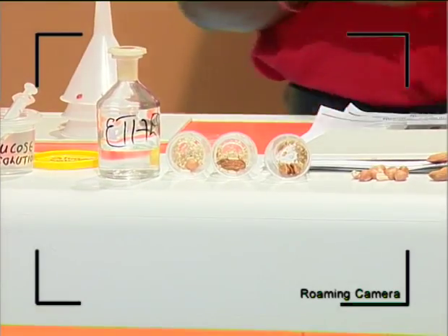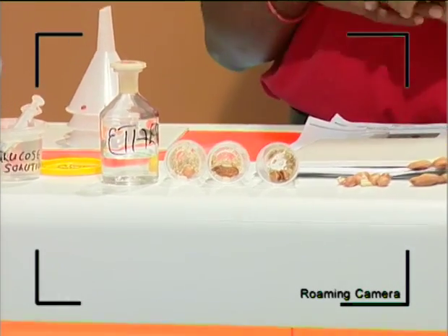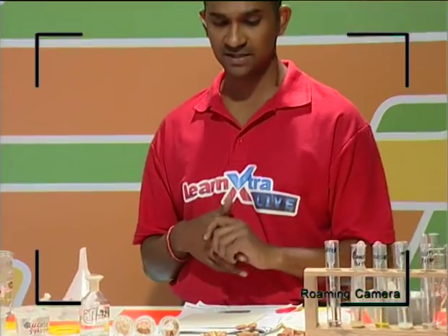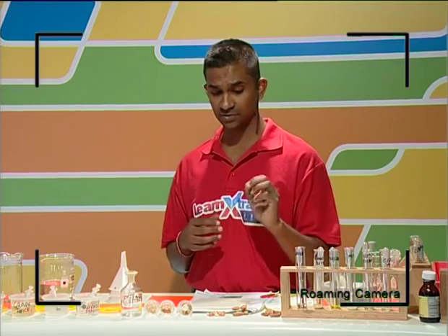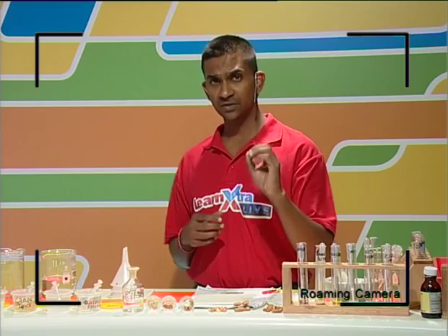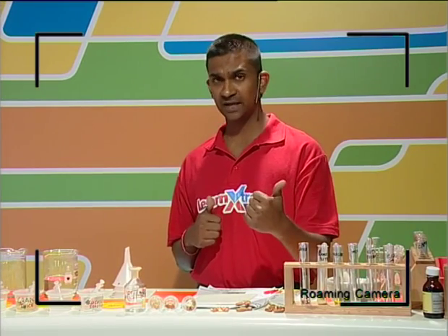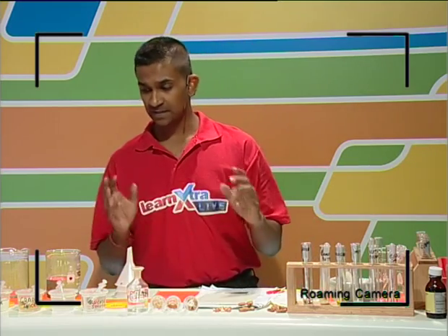We're going to test for the presence of lipids in these. I'm sure you've heard your teachers talk about the importance of nuts and grains in our diet, and today we want to establish why. They definitely have lots of proteins, but do they also contain important fats? We know there are important fats like the omega-3 fatty acids, and there are good fats and bad fats. So today we're going to look at samples that we've tested.